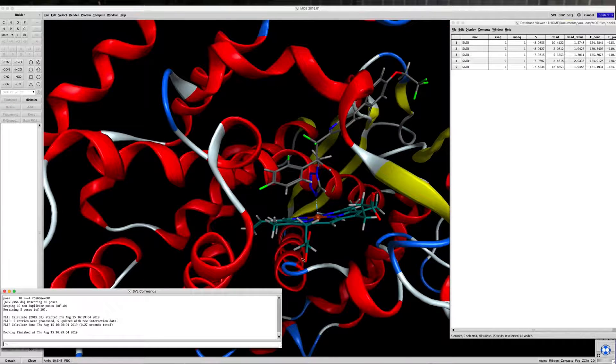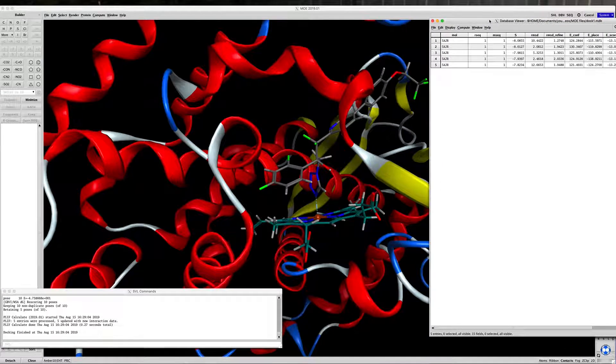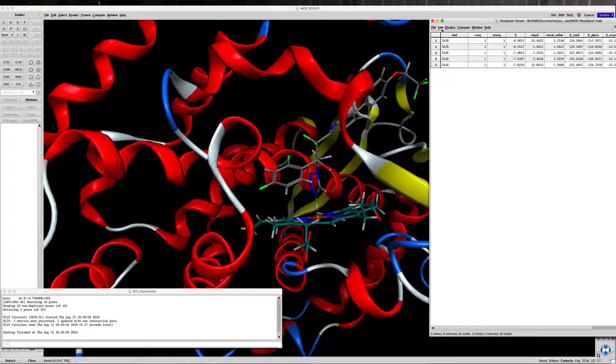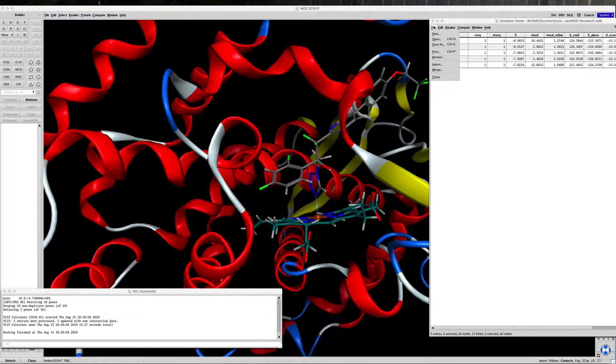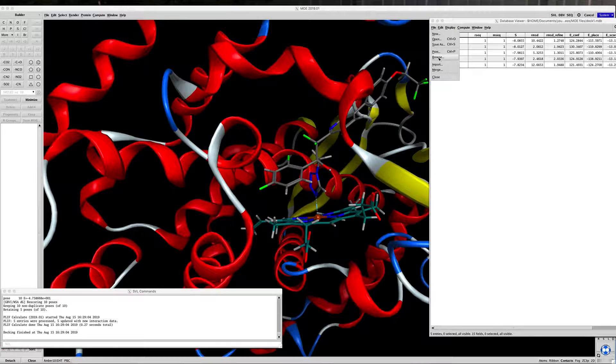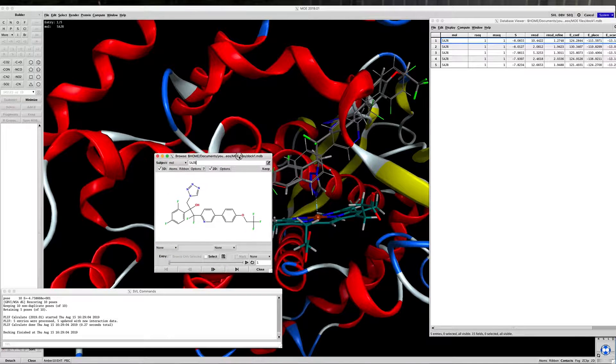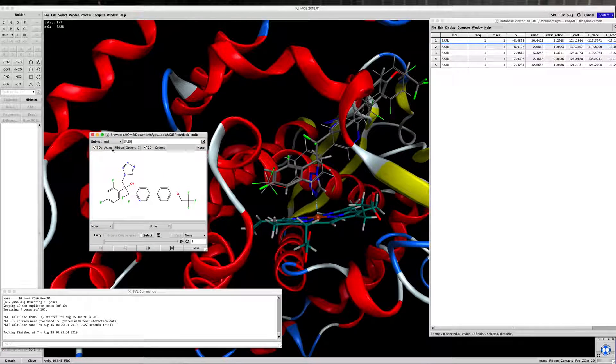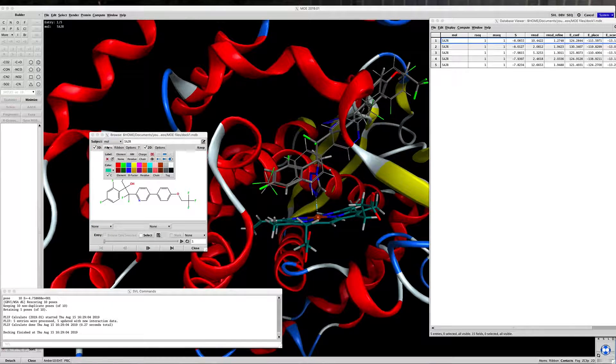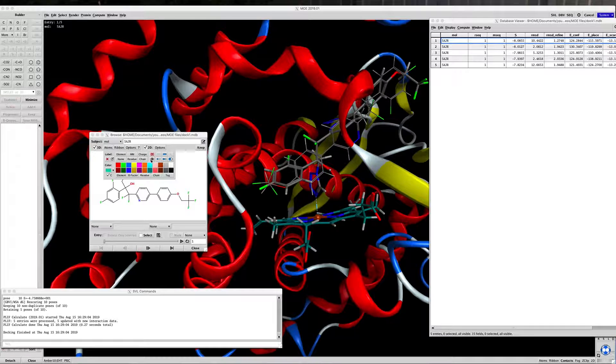And here is the results of the docking. To take a look at what the results are, we'll go to File, Browse, and a Browse window opens up.